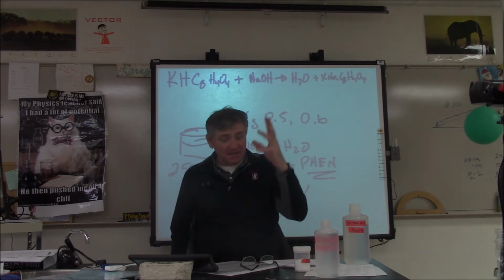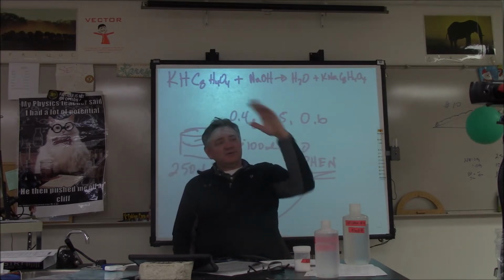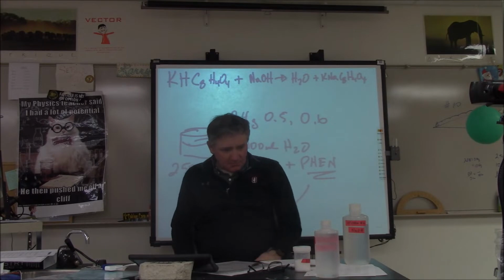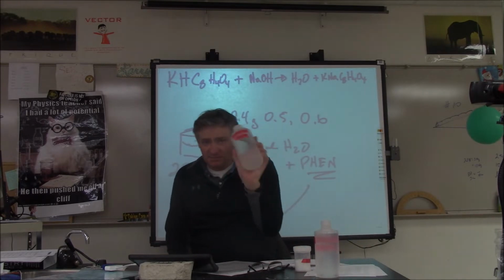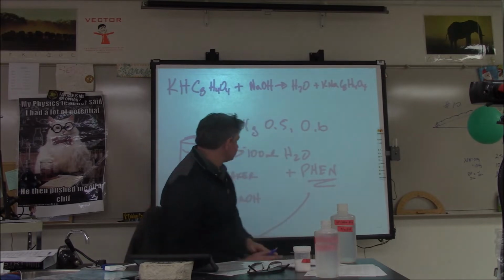All right, so I'm going to take you through the lab. There are two distinct parts to the lab. The first part is going to find the molarity of this sodium hydroxide. So we're going to use this reaction.